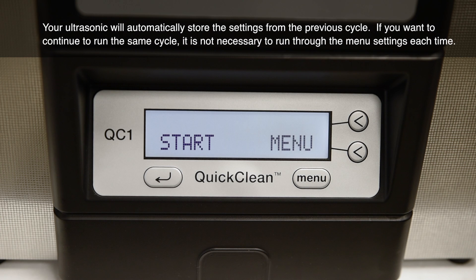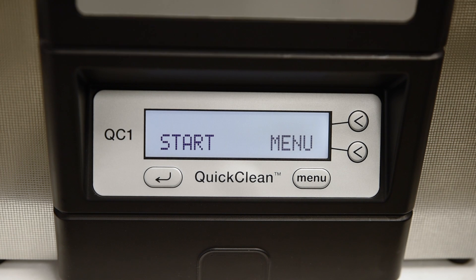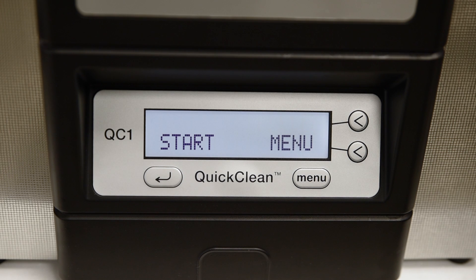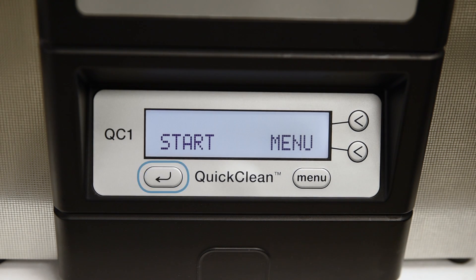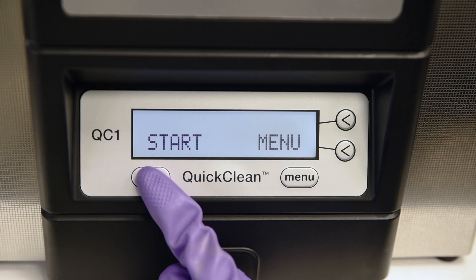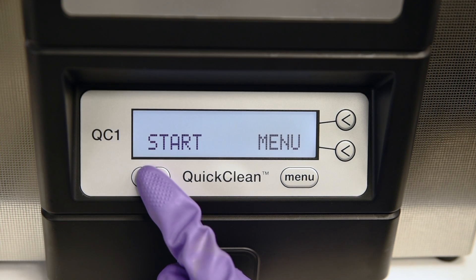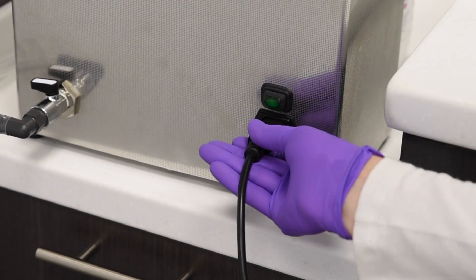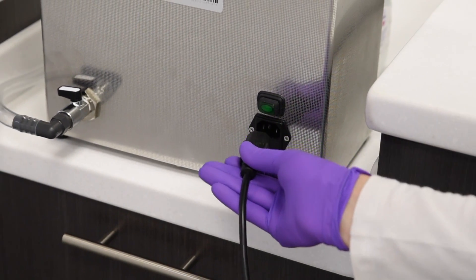If no changes are desired, or once changes have been made, press the menu key to advance to the next option. To leave the menu setting options at any time, press the left arrow button. To save any changes you make in the options menu, simply start a cycle. You must start a cycle prior to turning off or unplugging the unit to store your new settings.